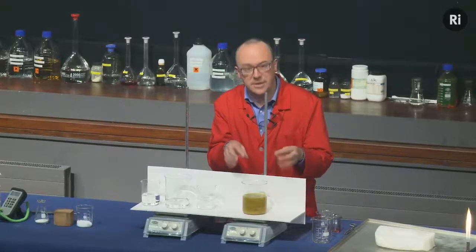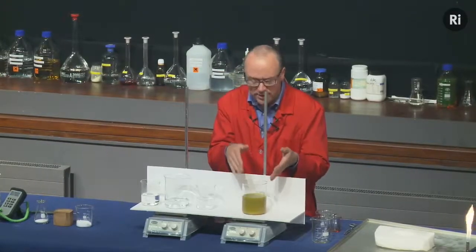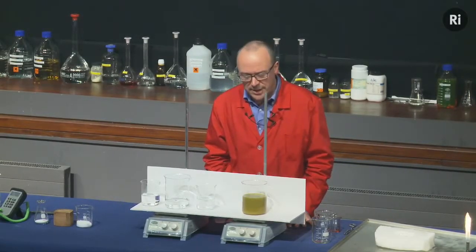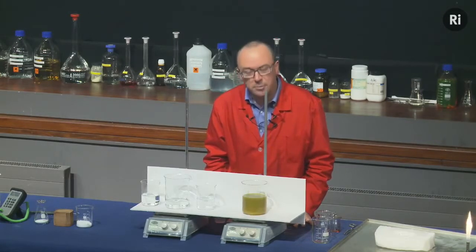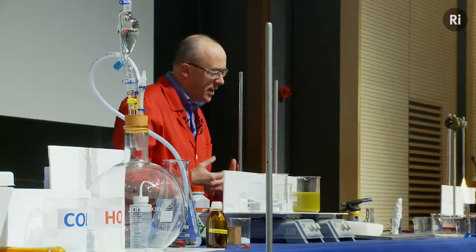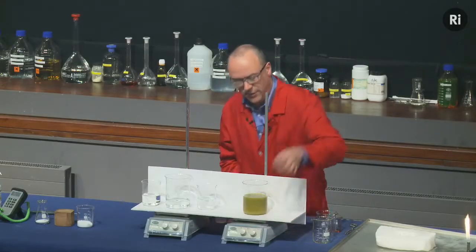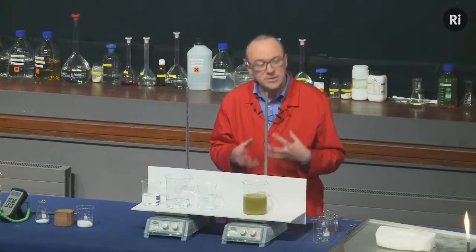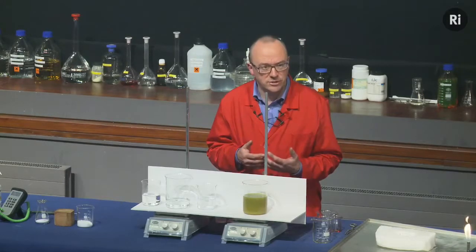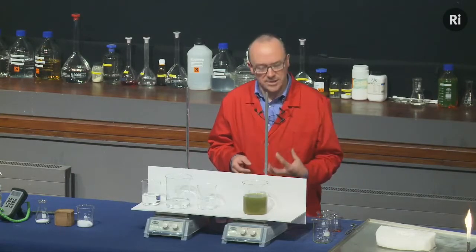Now in a minute or so, that muddiness will fade away, and we'll be able to see the colour of the solution. And what I want you to do is to watch the colour of this solution as it changes. Now, there's a rather interesting story behind this reaction. It was first discovered in about 1951 by a Russian chemist called Boris Belousov. And he was trying to study the way citric acid behaves in the human body. And so he was mixing various materials together in a beaker, and he discovered some very interesting colour changes, and in particular he discovered an oscillating chemical reaction. That is, a chemical reaction that went through a sequence of colour changes and then came back to the starting point.